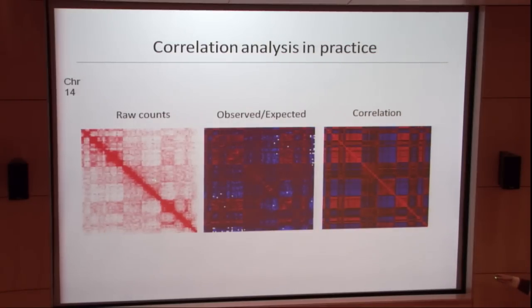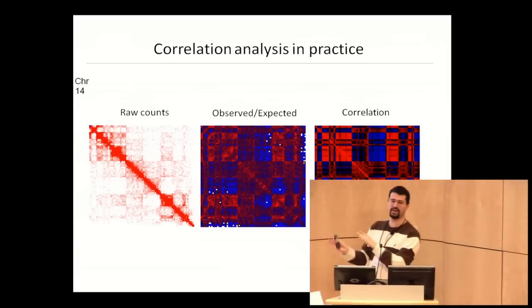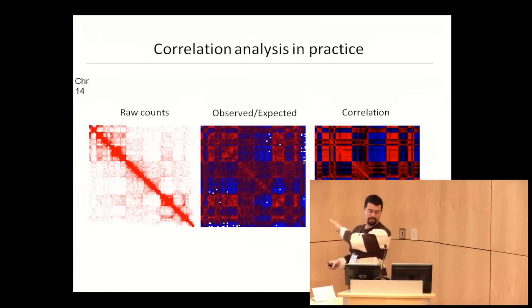What's important about this is that when you look at these proximity problems where the fundamental data type is genome-wide by genome-wide, the matrix that underlies all this is 3 billion by 3 billion. I believe the total number of possible interactions is about 10 sextillion. 10 sextillion turns out to, amazingly enough, still be a larger number than the number of reads that a HiSeq produces in a week. It's hard to imagine that those sorts of numbers exist, but it is bigger. It highlights the fact that whereas everywhere else in sequencing land you can kill the problem data-wise, you can just put as much data as you need, you can never kill the problem with these things.